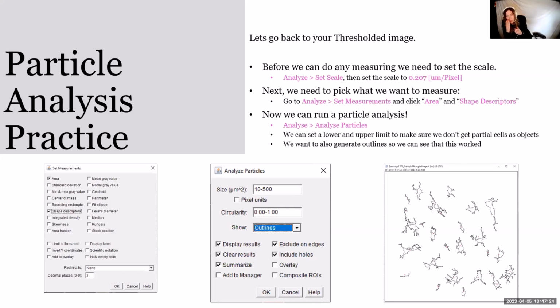Yeah, actually, the watershedding will be done in the find maxima function, which we're using in the next example, I believe. Basically, I think it finds individual maxima points based on your settings and then creates a single particle outline around them. Yes. The problem was the inverted scale. Okay.